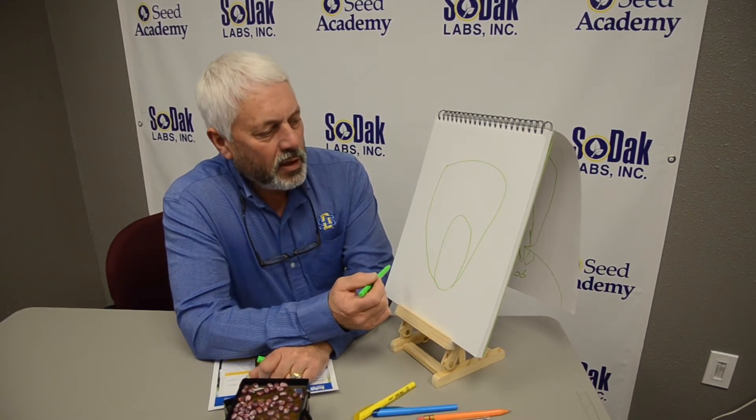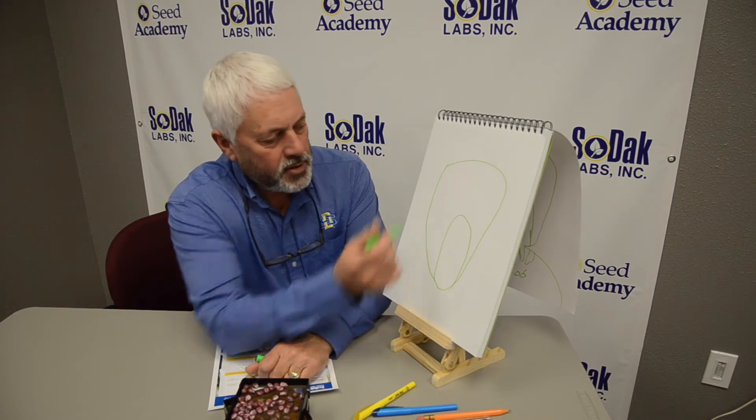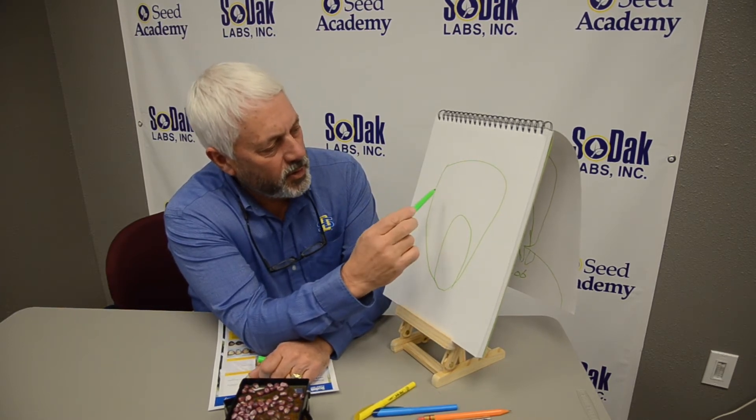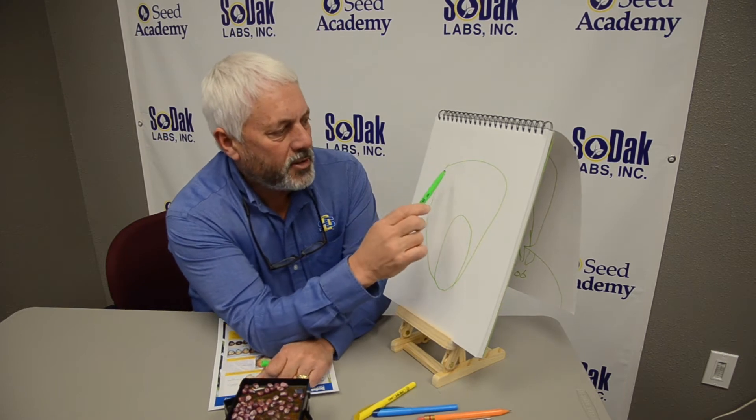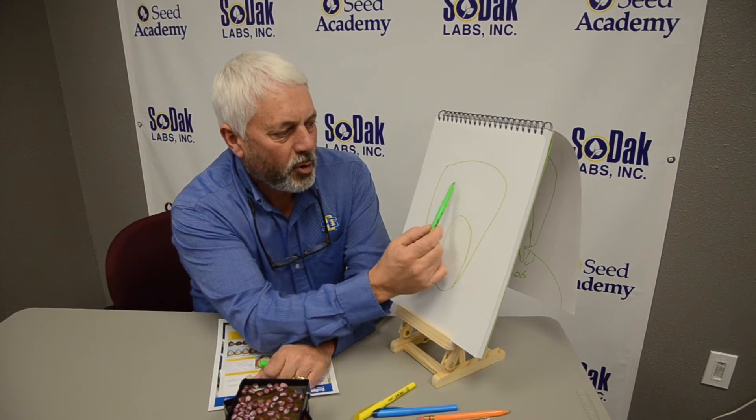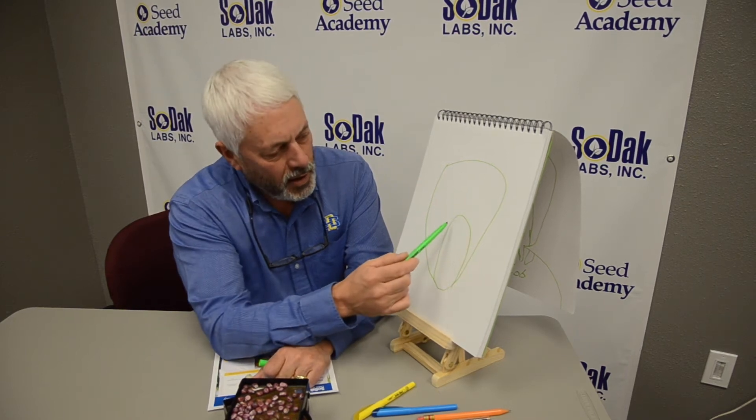So what we're doing in a pericarp damage test is we're looking at damage to the pericarp. The pericarp is basically the seed coat on the kernel. So here we have our endosperm area and then we have our germ face here.